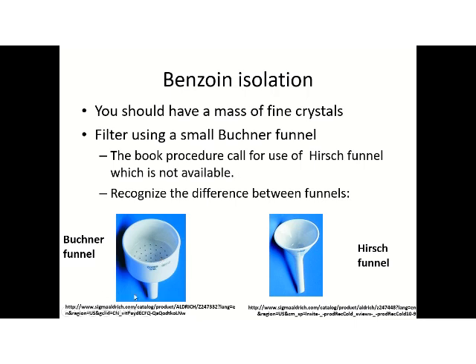As you can see, the difference between the Buchner funnel and the Hirsch funnel, right?